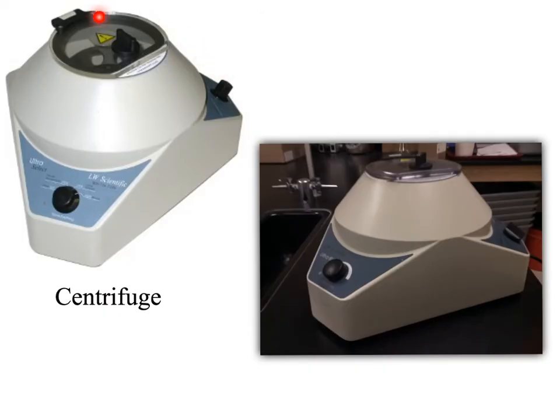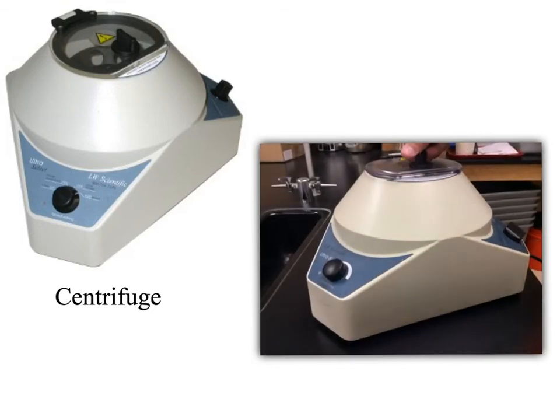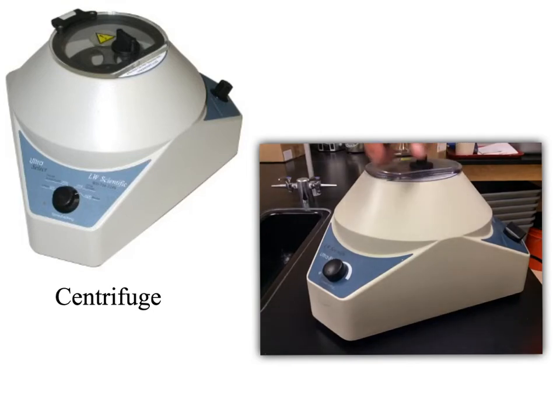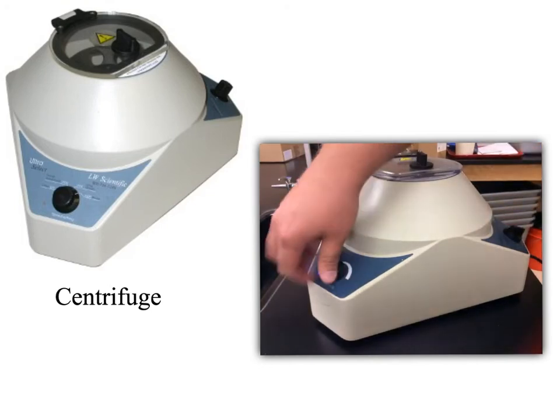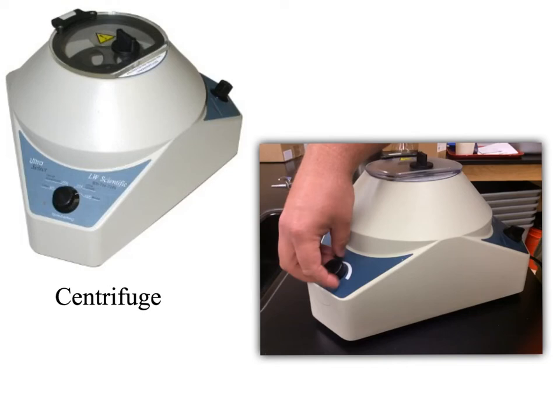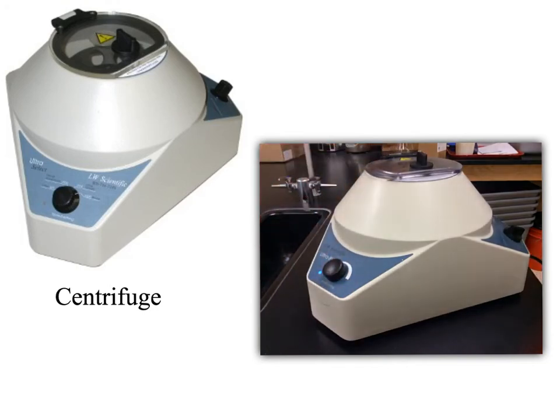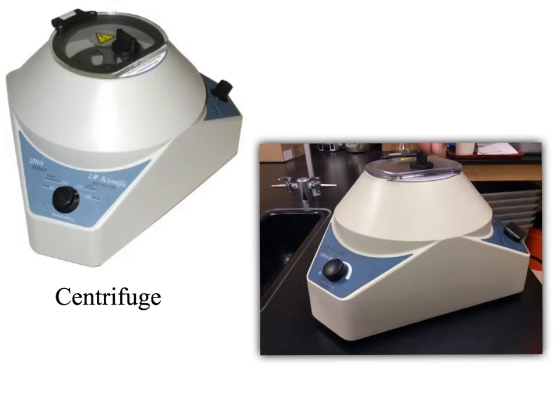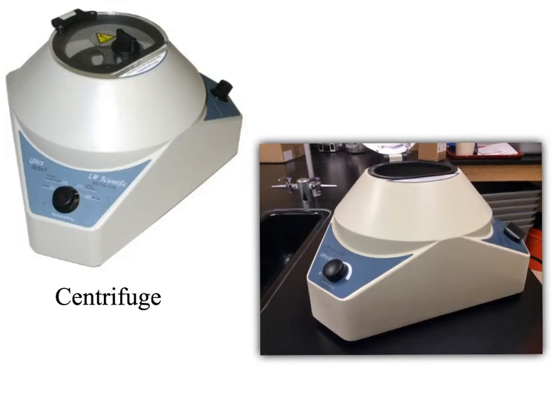This is called a centrifuge, and its function is to separate liquids by density. It has a lid that you open, place your samples inside, then close and lock. One knob adjusts the speed and another adjusts the spin time. One safety issue: you can never open it while it's still spinning. Never put your hand into a moving centrifuge. So the centrifuge separates liquids by density.